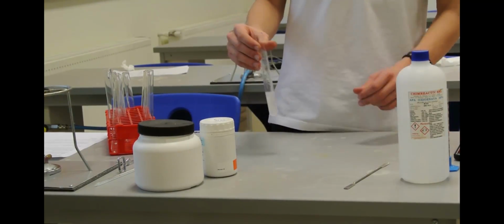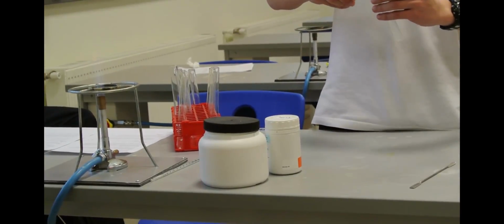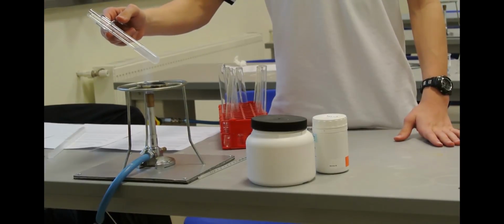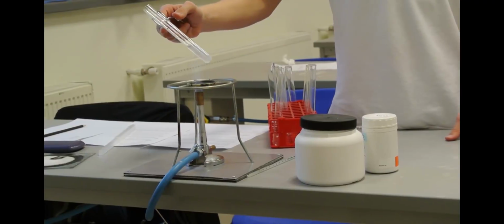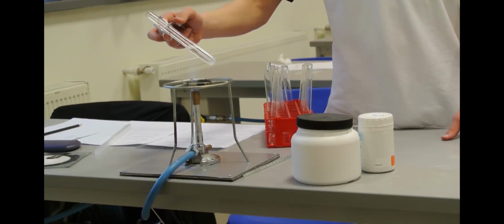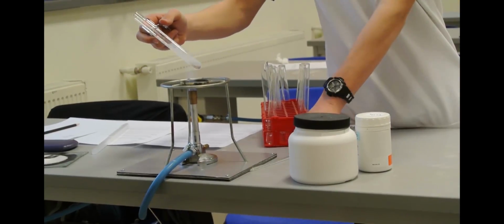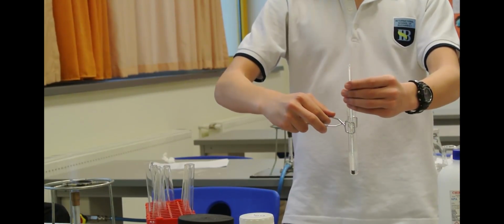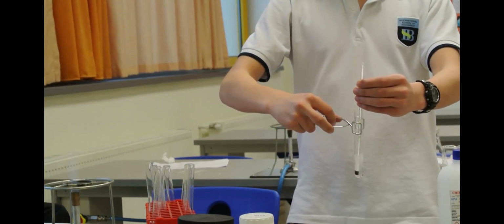Okay, so now that it has dissolved, I'm going to heat it over the Bunsen burner and note the temperature of when the reaction occurs. Okay, so now I'm going to record the temperature, and the temperature is 94 degrees Celsius.